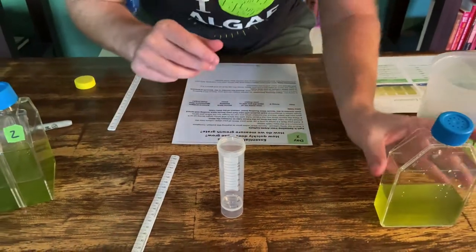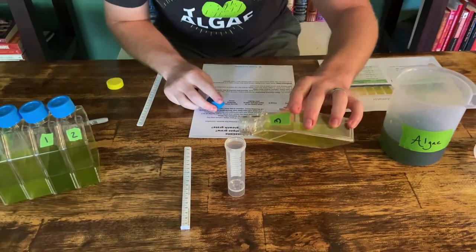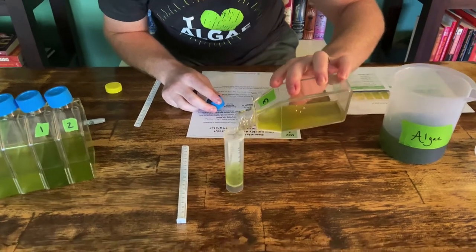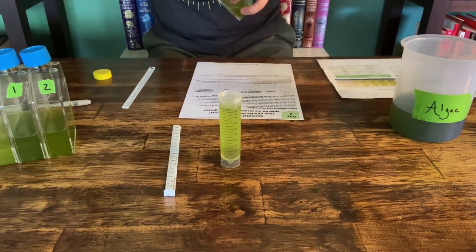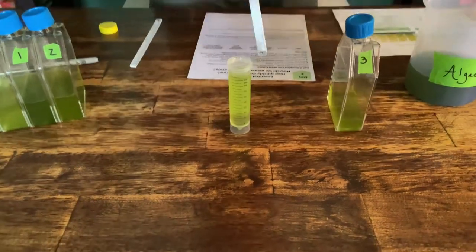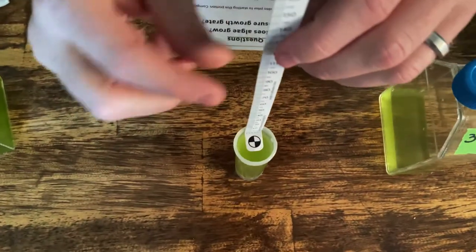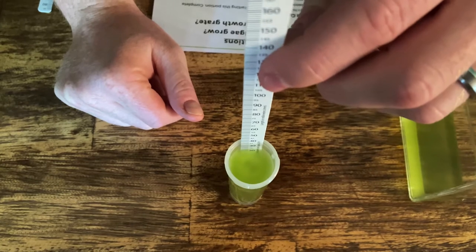So let's try this out in real time. We're going to shake our culture up and fill up the skirted falcon tube to 50 milliliters. Algae is looking healthy. And so we're going to take this SecchiStick and drop it down into the water until that shield disappears.